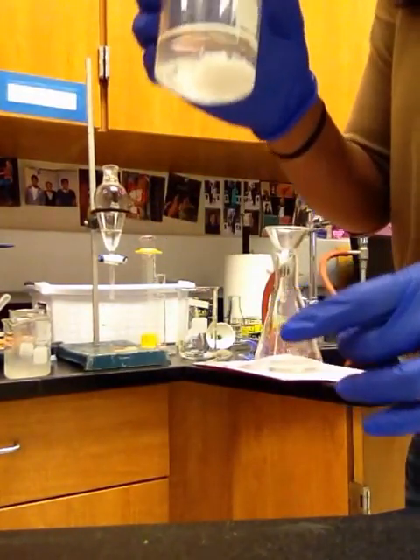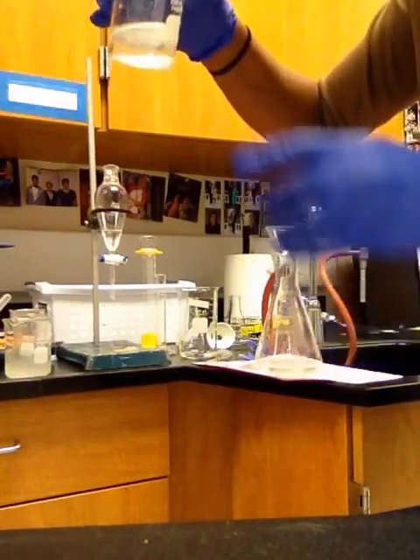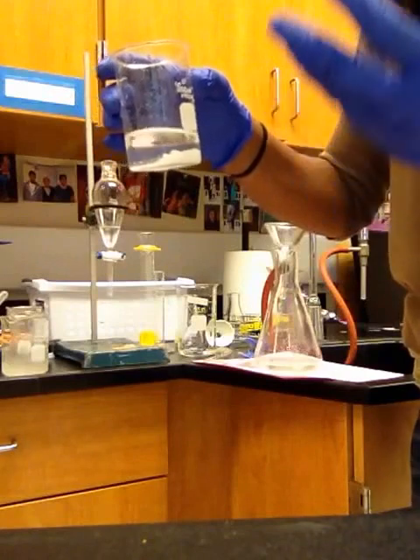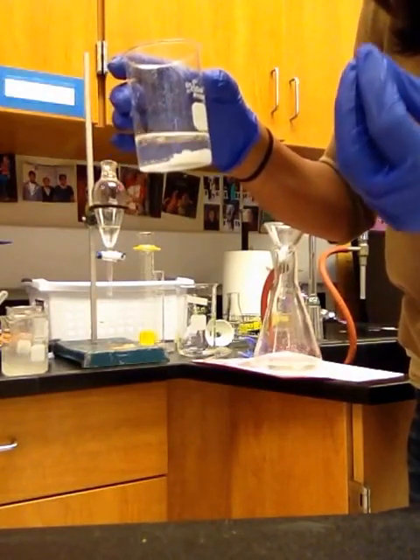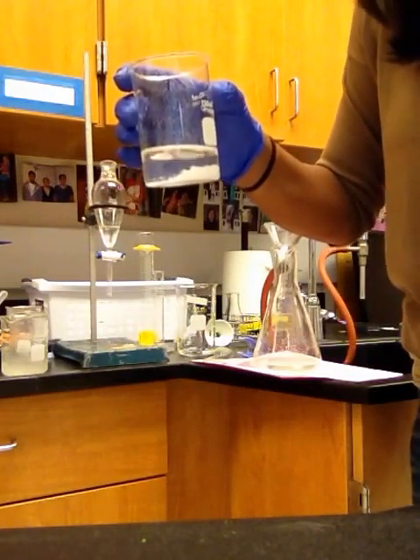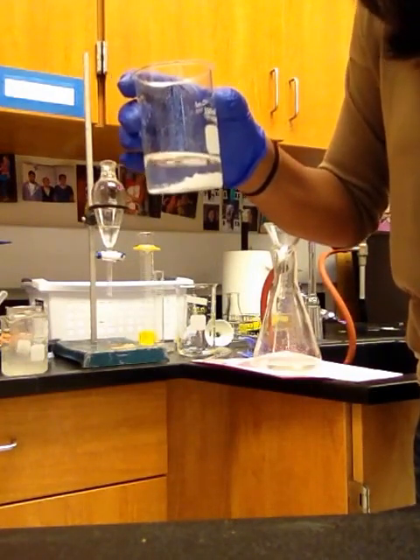Now you're going to pour it into a pre-weighed beaker, making sure to leave the MgSO4 behind. And now we're going to put this ethyl acetate that has been dried in a pre-weighed beaker over a water bath. I will show you that procedure in class.